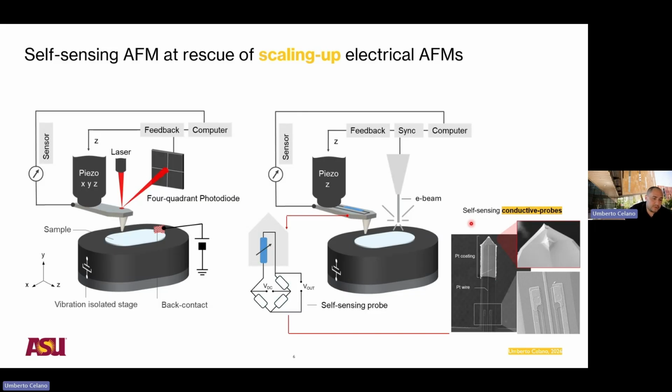Now, Alex explained pretty well and showed a bunch of images. Their system is capable of going into a FIB-SEM, or you can imagine having this kind of configuration attached to any other existing CD-SEM or any other SEM machine. So there would be some kind of electron beam in place capable of impinging in proximity of your probe. This is literally the whole idea behind our concept. From now on, most of the data I'm going to show are generally acquired in this configuration, in this kind of system where we use a self-sensing probe and an e-beam in proximity of the probe.